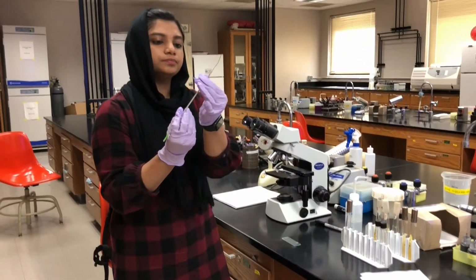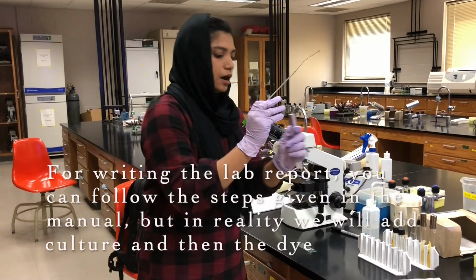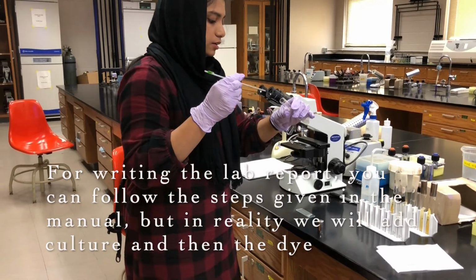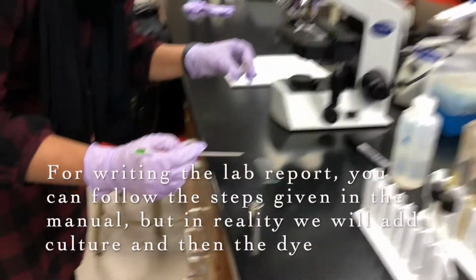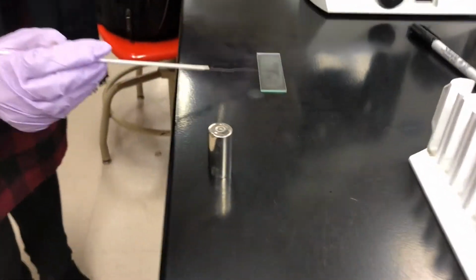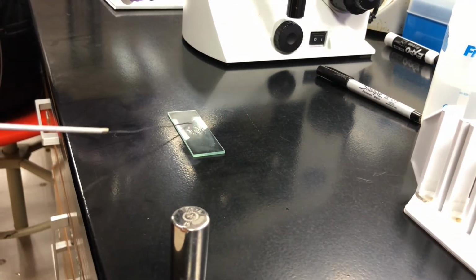I think the loop is cool enough. So now I'm going to add again 2 to 3 loopfuls of the culture onto the slide. You could see that I'm just spreading it nicely onto the whole glass slide.